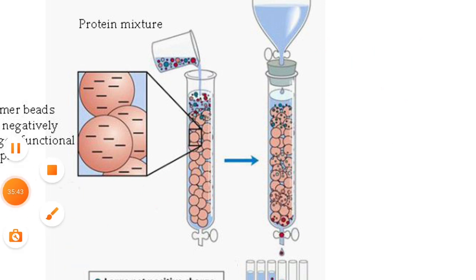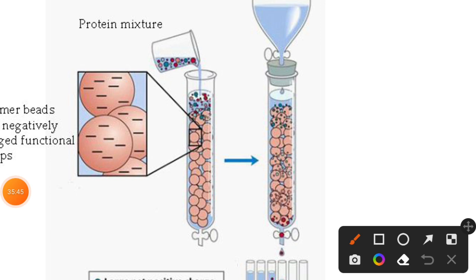So what are the advantages? The first advantage I want to mention is that it is environmentally friendly. Here we are using various kinds of binding charge groups, right? And the resins have a longer life. Synthetic polymer resins have a long life and are obviously cost effective. Its maintenance is very cheap.